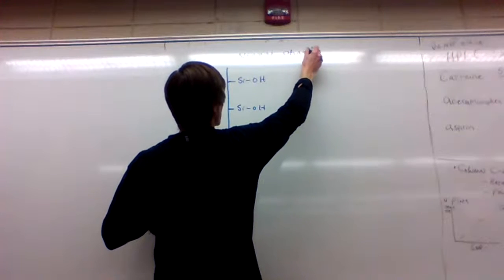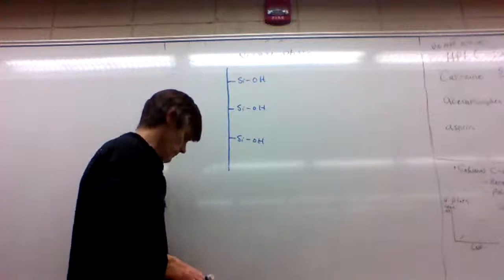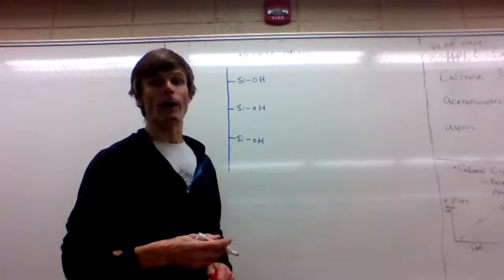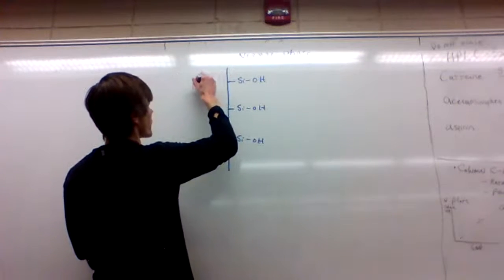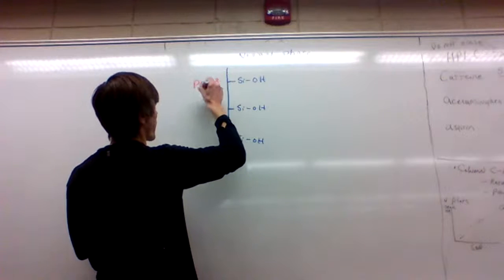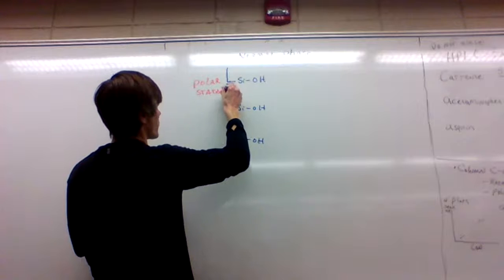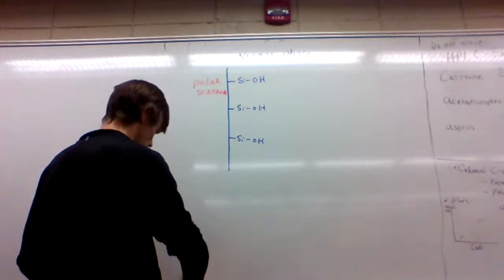Normal phase, polar stationary phase. And we're going to run a nonpolar mobile phase.